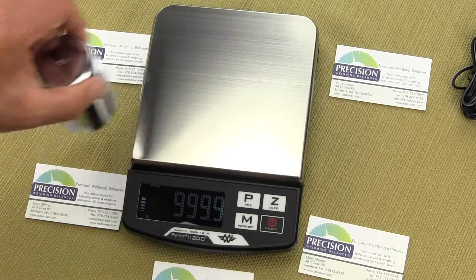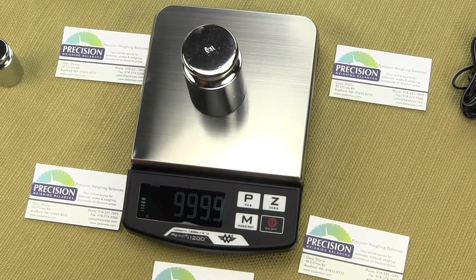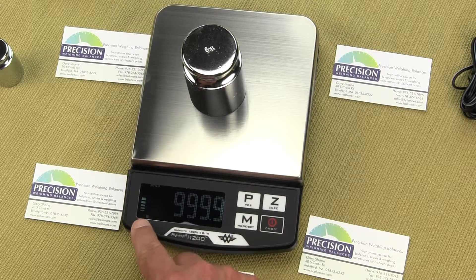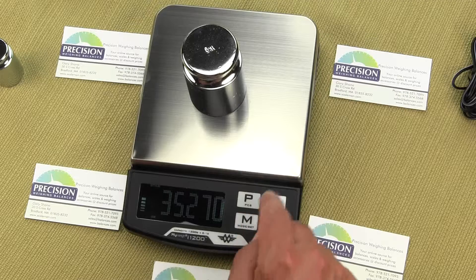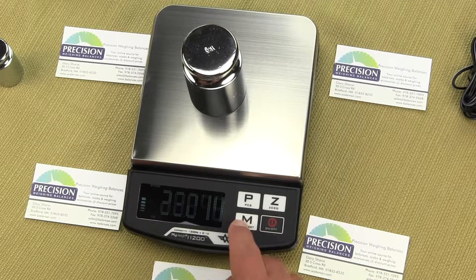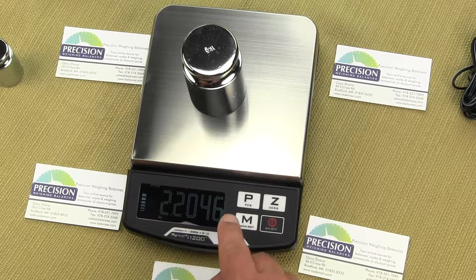Now let's look at how to change the weight units. This is 1000 grams. If we press the M key, in the lower left-hand corner you'll see G for grams. Press it once and that gives us ounces — it goes to three decimal places, so 0.005 ounce increments. In pounds it increments by 0.0002 pounds.